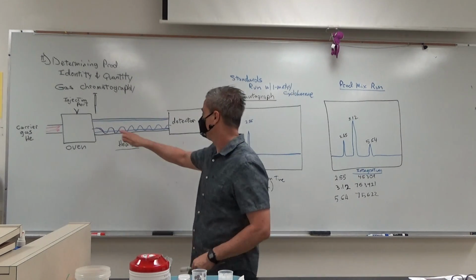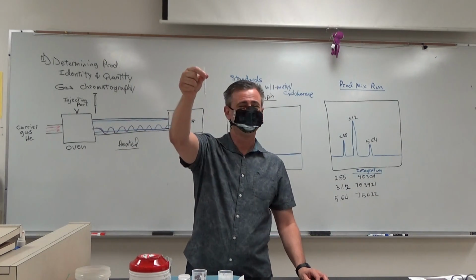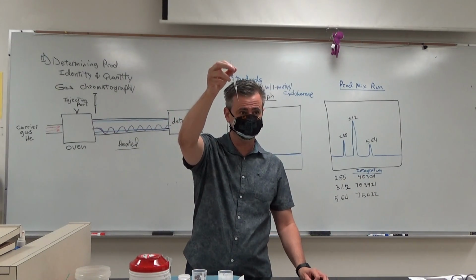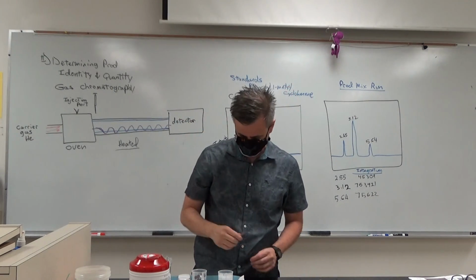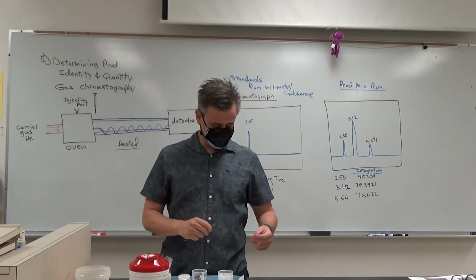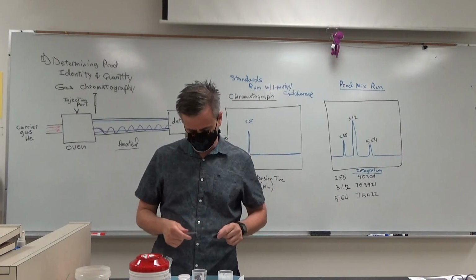And acid can be rough on this column. So we want to get the acid out of it. So we put in a tiny bit of cotton, okay? A nerd size of cotton. Stuff it down there with this dude, all right? And then in the instructions, I say something like 1/3 of a teaspoon, just because it's a visual thing.